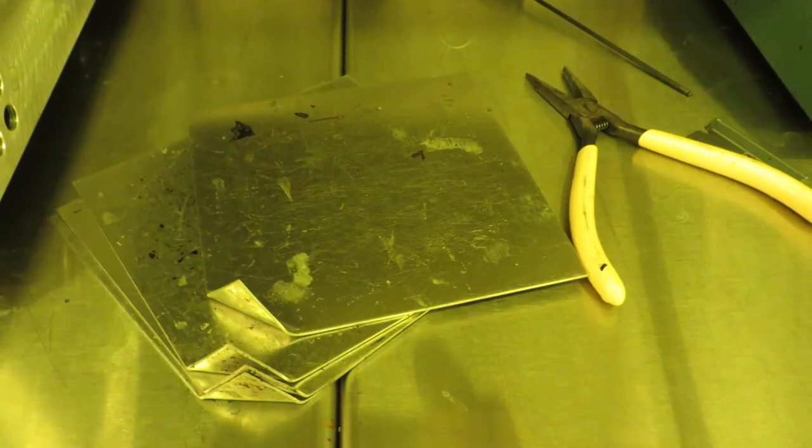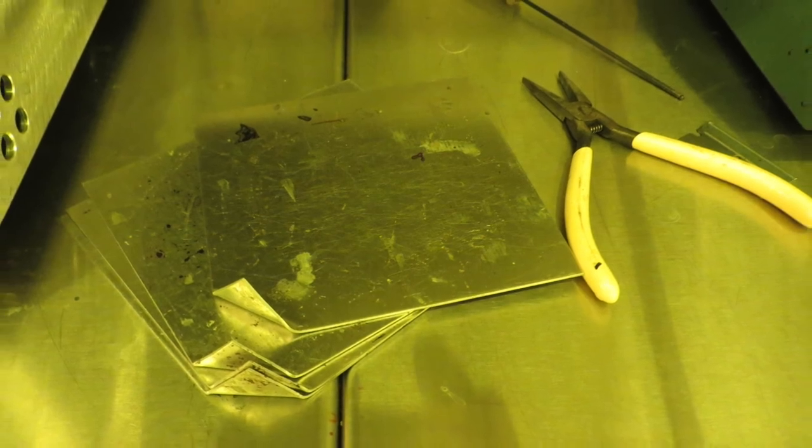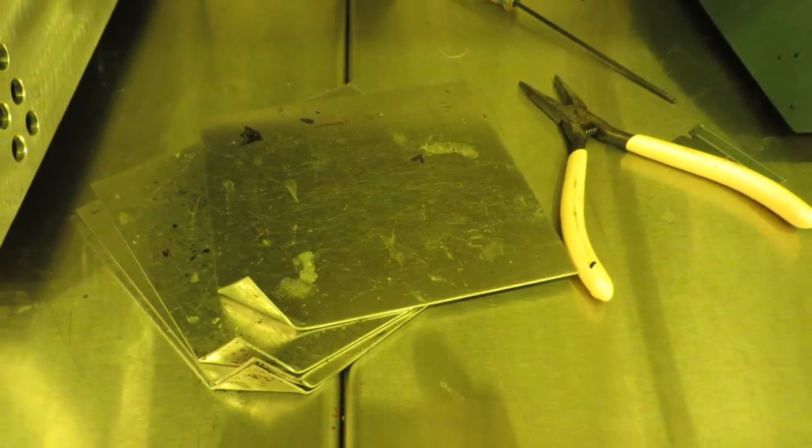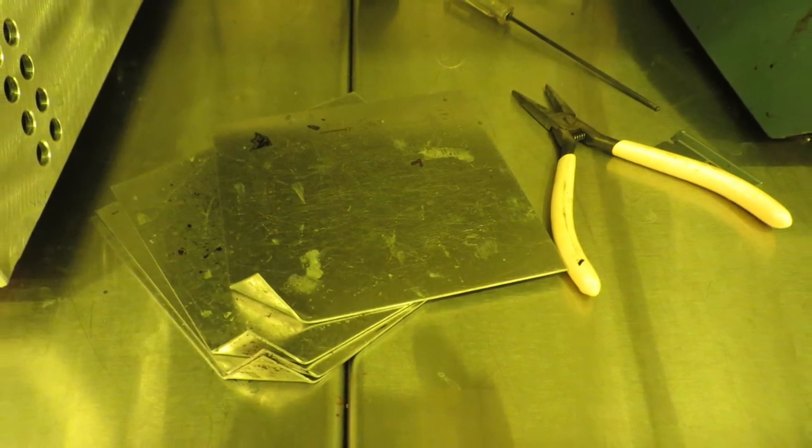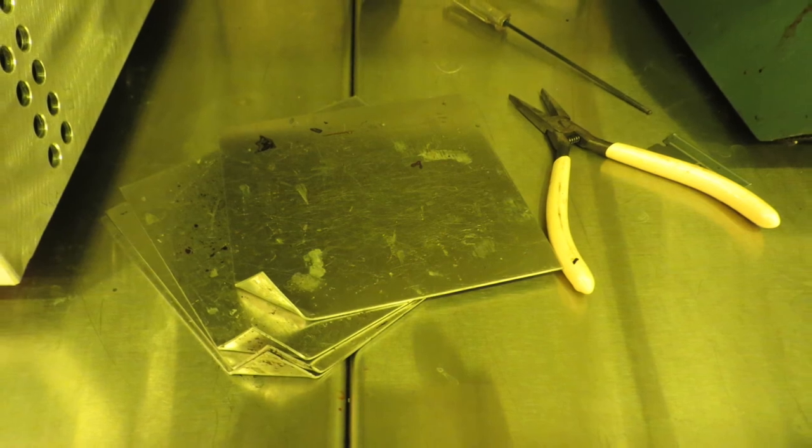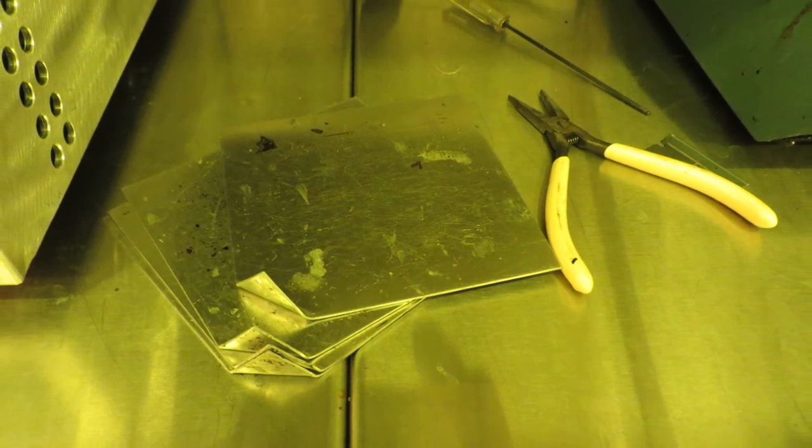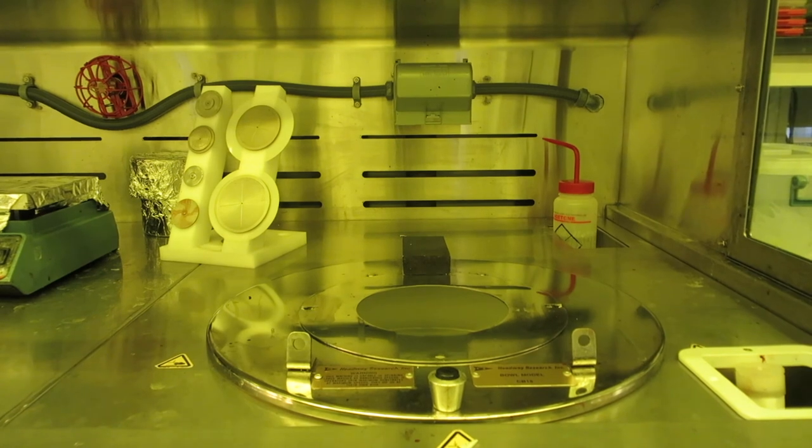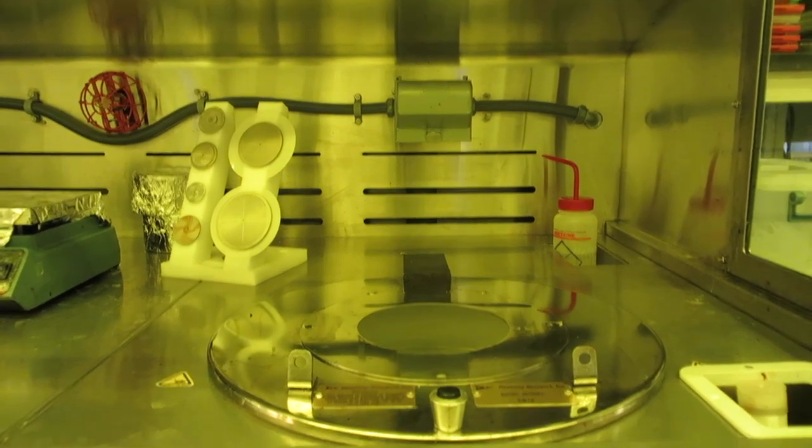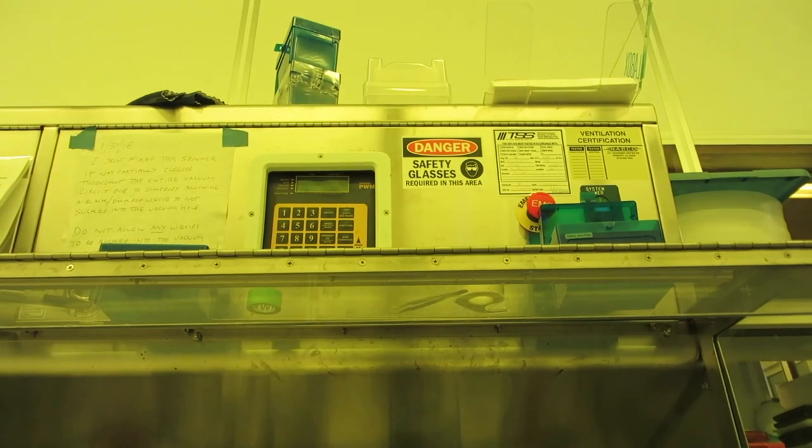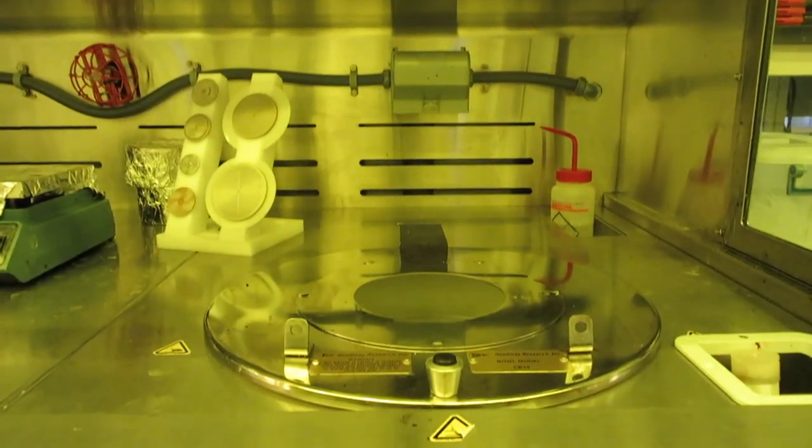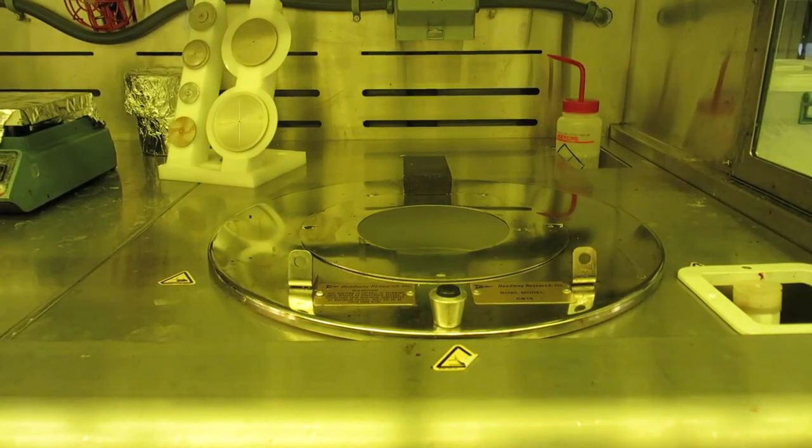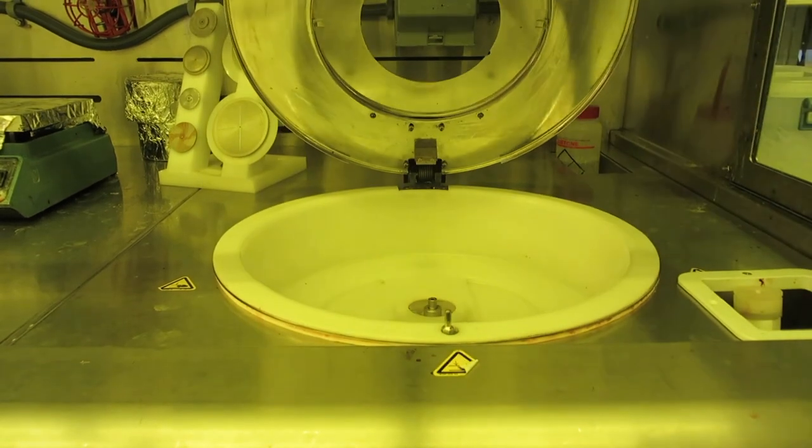Wafers coated with most normal resists can be placed directly on the hot plate, but for things that are difficult to remove once they're hardened like SU-8, you should use these little sheet metal trays to put them on the hot plate so you don't mess up the surface of the hot plate. This is the Headway spinner. To the left of it is a stand full of various chucks to use on the spinner. The controls for the Headway are up above in the head casing. A foot switch on the floor is used for stopping and starting the spinning process. You'll need to be trained separately on this spinner before using it.